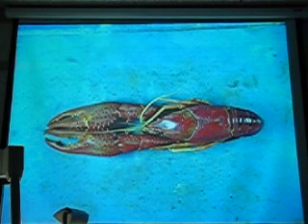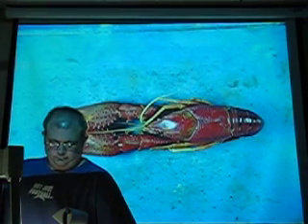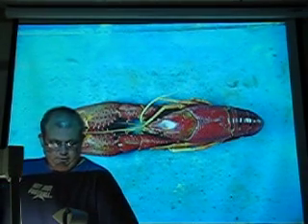What subphylum? Crustacea. Crustacea. With clasp. Malacostraca. Malacostraca. Or the hockey player named Stracca.